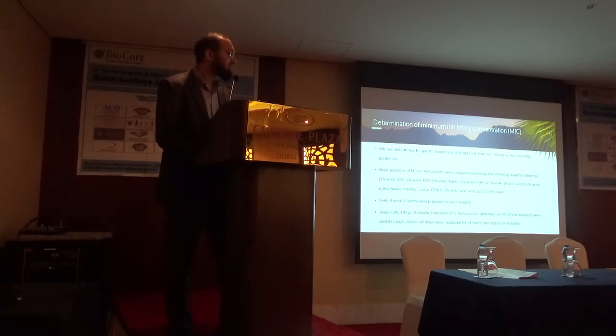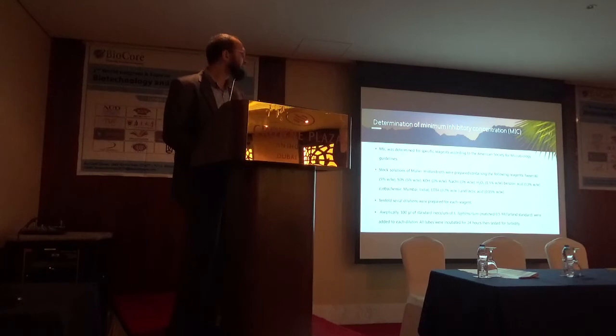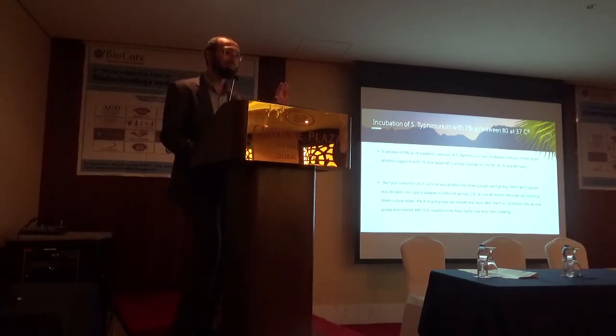And after that, aseptically, we added 100 microliters of standard inoculum of Salmonella typhimurium, standardized by 0.5 McFarland. Microbiologists know that. It was added to each dilution, all tubes were incubated for 24 hours, then tested for turbidity. The first dilution lacking turbidity, the clear tube, was considered as the MIC, or minimum inhibitory concentration.